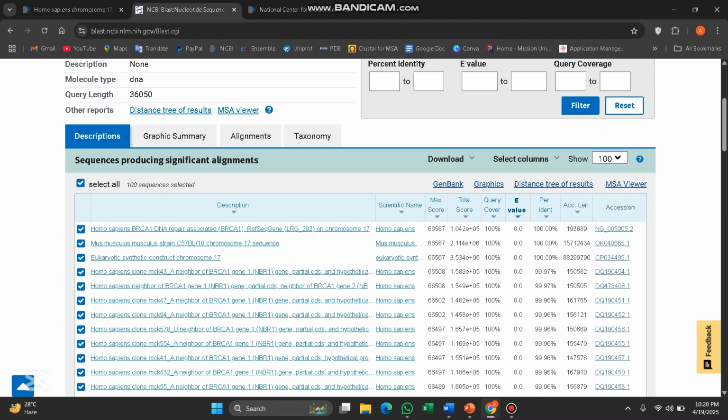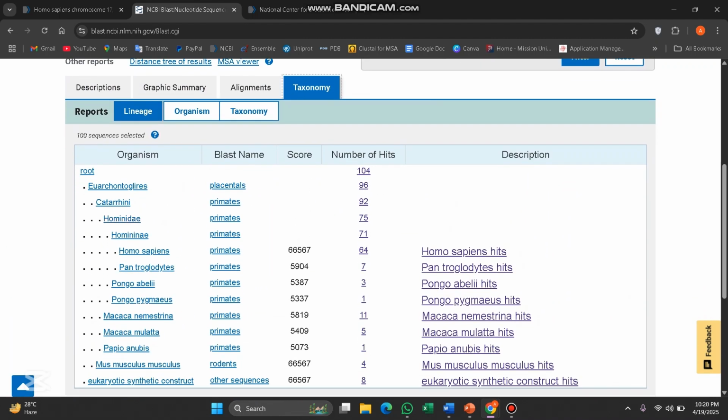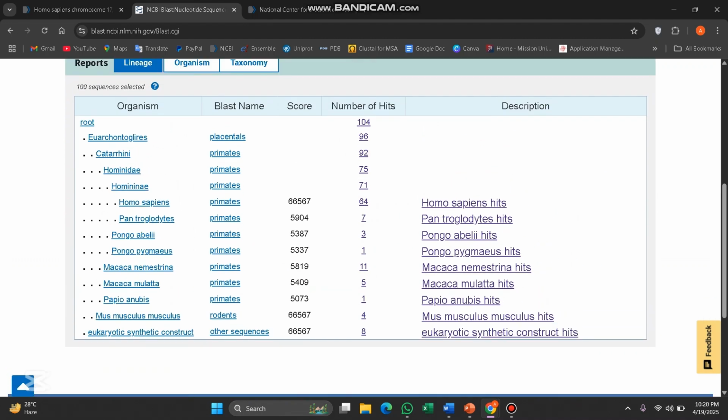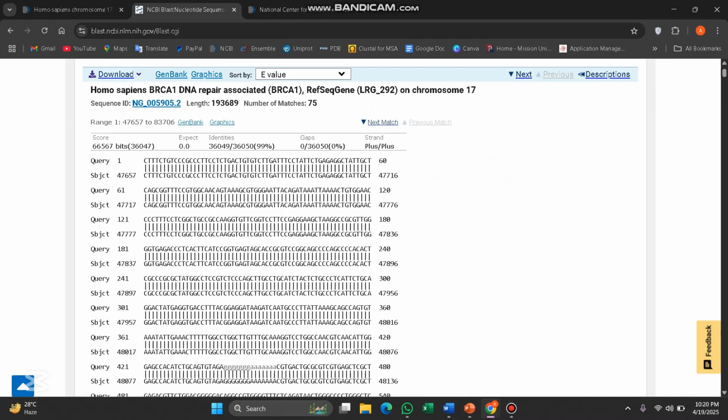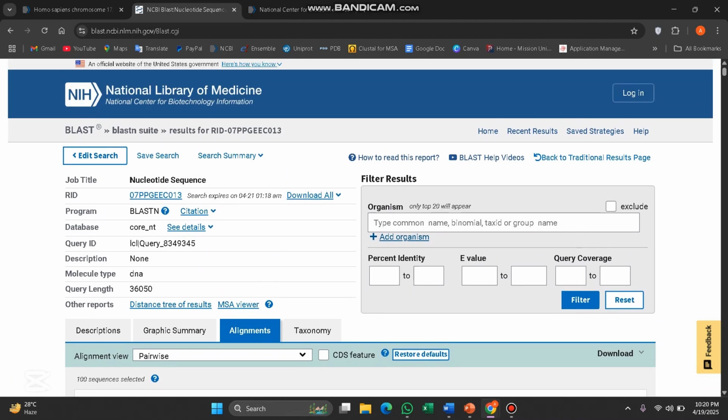On that basis, the whole subject of genetics and evolution is built. In the taxonomy you get the root, Hominidae, Homo sapiens, primates, and in the alignments you get 100%. The E value is zero, because it is not randomly matched. The gaps are 0%, the score is very high, and identity is more than 99%.